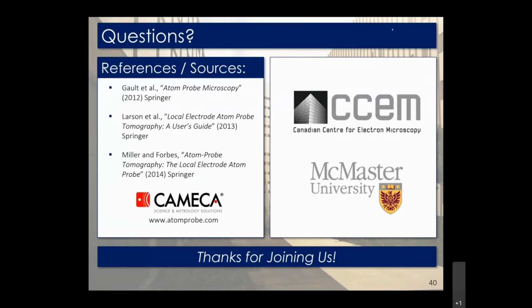Great. So there's one question on the slide assigning the main peak for, I think that's a typo, but bowl and voltage collection, maybe not. Should one avoid the peak originating from overlapping elements through the main peak? So I believe the question is asking if we're running the time of flight correction for a given peak, is there an issue if we have overlaps on that peak?